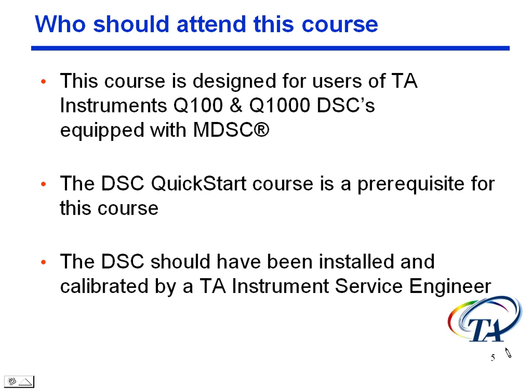Now, this course is designed for users of our Q100 and Q1000 DSCs equipped with modulated DSC. There are some screenshots, and a lot of specifics that are for the Q series. Now, if you have a 2900 series, you may be able to pick up a few things out of this, but just bear in mind that this is specifically designed for the Q series.